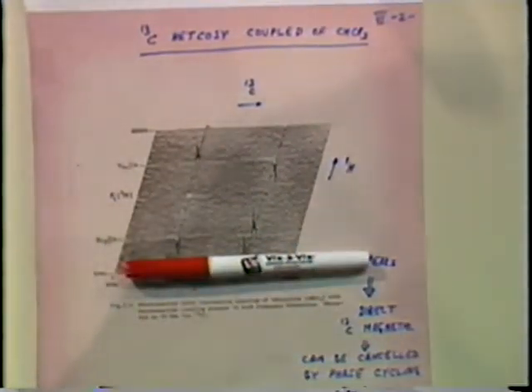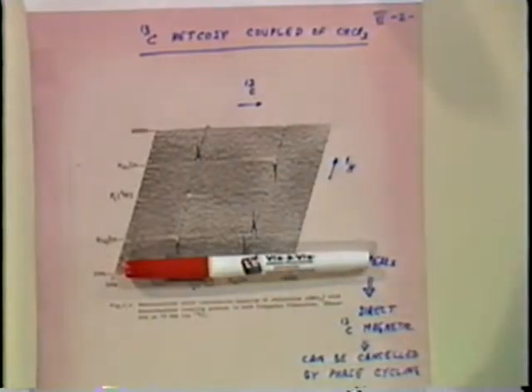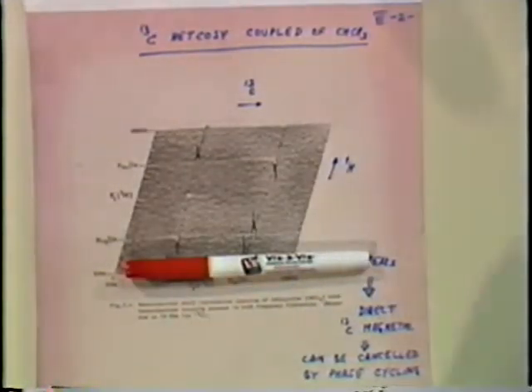When we look at this spectrum, it has information that we want, that which proton coupled to which carbon, if we had a chemical shift information and a number of other such cases. But immediately it becomes apparent that it would be nice if we could decouple them. Okay, and so we will then only need the chemical shift type of information, and this can be done in various stages.